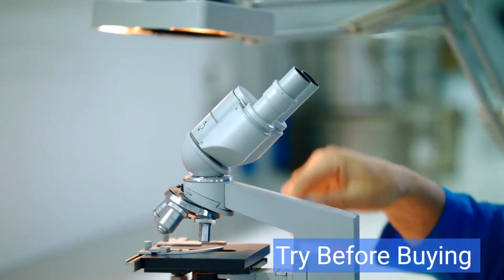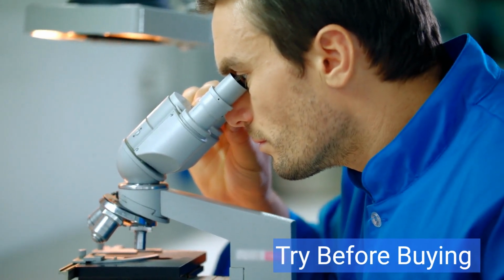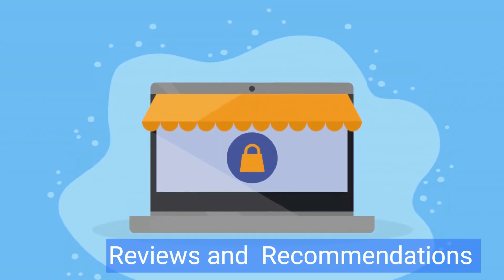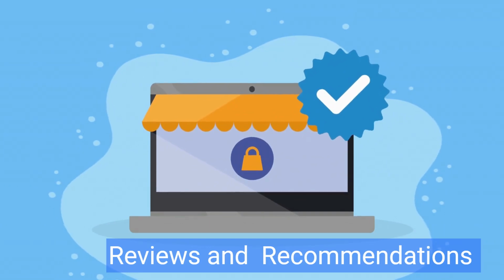Step 11. Try before buying. If possible, visit a local store or a laboratory and try out different microscopes to get a feel for their usability and features. Step 12. Read reviews and seek recommendations. Read reviews from other users and seek recommendations from peers or professors who are familiar with microscopy.